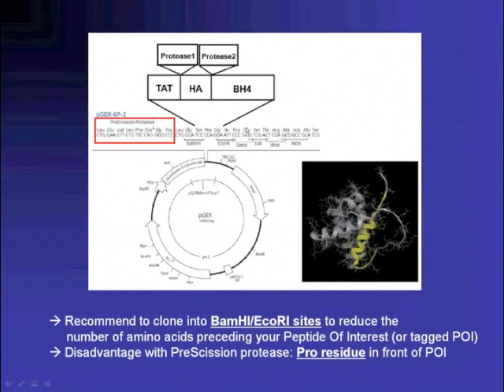Of course, if you're working with small sequences, you want to avoid unwanted residues, and in this case you still have the glycine, proline, leucine that would be present. I found this maybe a disadvantage, this proline residue, because we know prolines might affect the structure, and we might have interference from some of these residues in our assessment of the biological activity. It's a consideration one can make. We could introduce other protease sites that are convenient there, and it's definitely solvable.